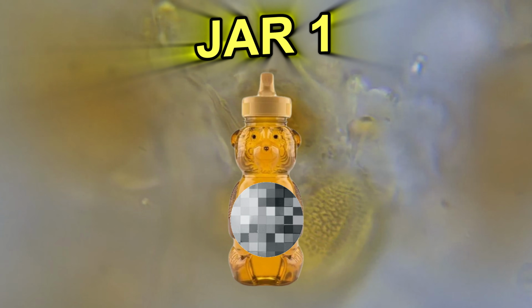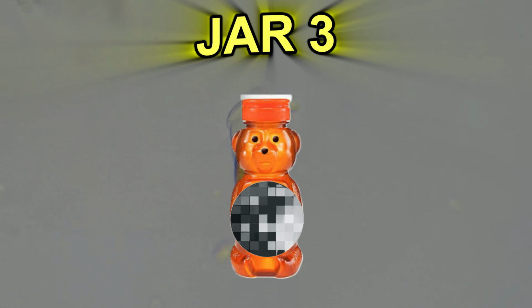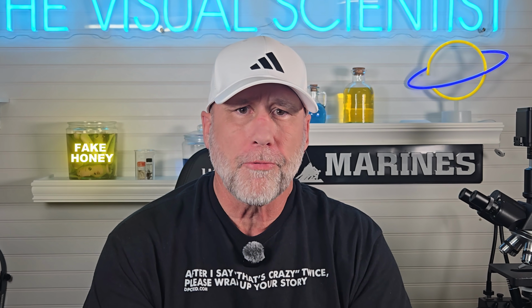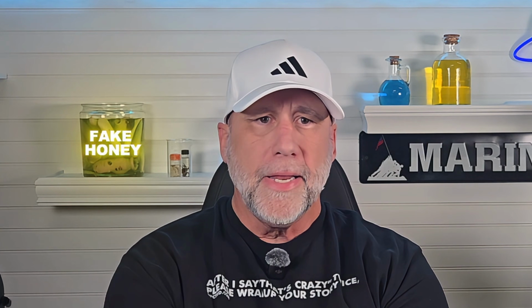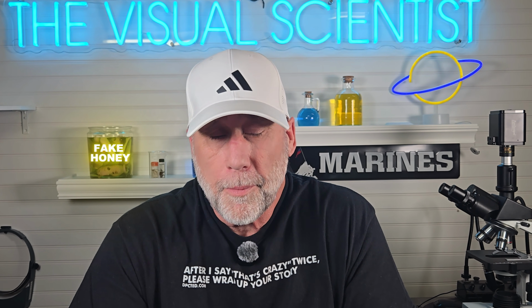3 jars, all labeled honey, all on the same grocery store shelf. Under the microscope, they look like they came from 3 completely different planets. I need to show you guys something. Today we are going under the microscope with honey, and I'm going to be straight with you.